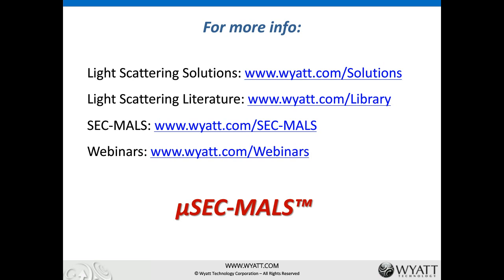Okay. And I think we have enough time for maybe one more question. Can UHP-SEC with microDAWN be used for carbohydrates? Oh, yes. So if you know the dn/dc of the carbohydrate that you're interested in, then yeah, definitely you can use it for carbohydrates. That's a great question, actually, because you probably cannot use UV to determine the concentration of your carbohydrate. So an RI detector would be preferred in that case.